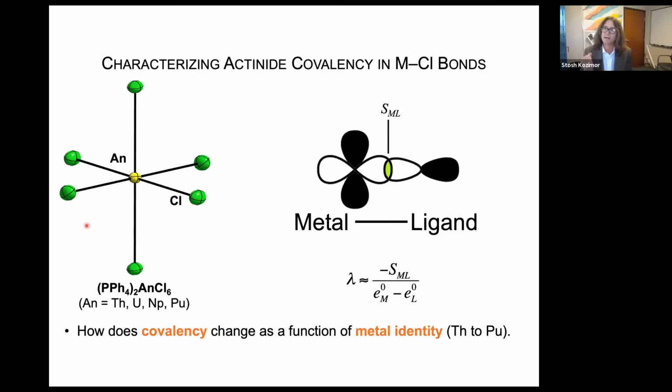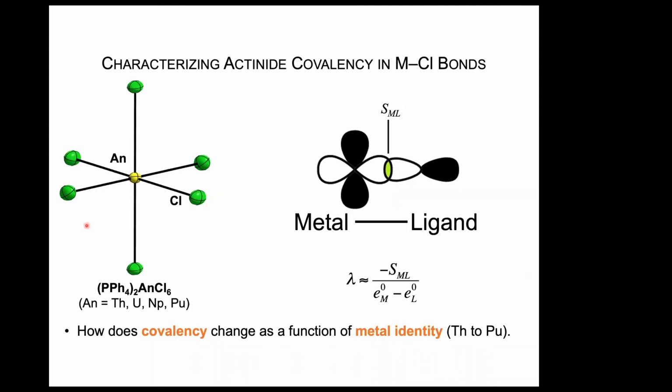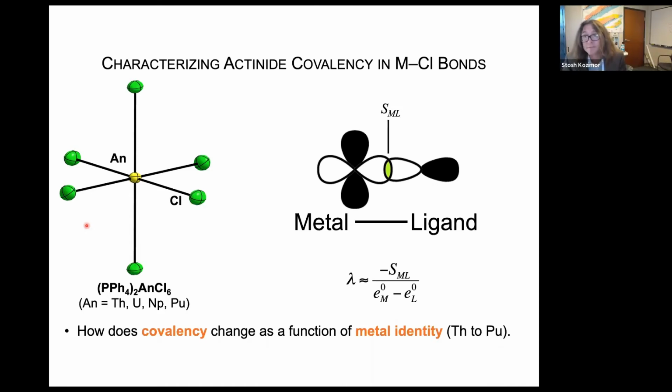When we make these samples, we grind them up, and we distribute them and we suspend them in a little bit of boron nitride, and we paint them on some tape to make sure that they are randomly oriented in the beam. There are other compounds that we have looked at where we have done some polarization studies, and we're about to publish that. Yeah, do you do these measurements in transmission then, or fluorescence? Fluorescence.